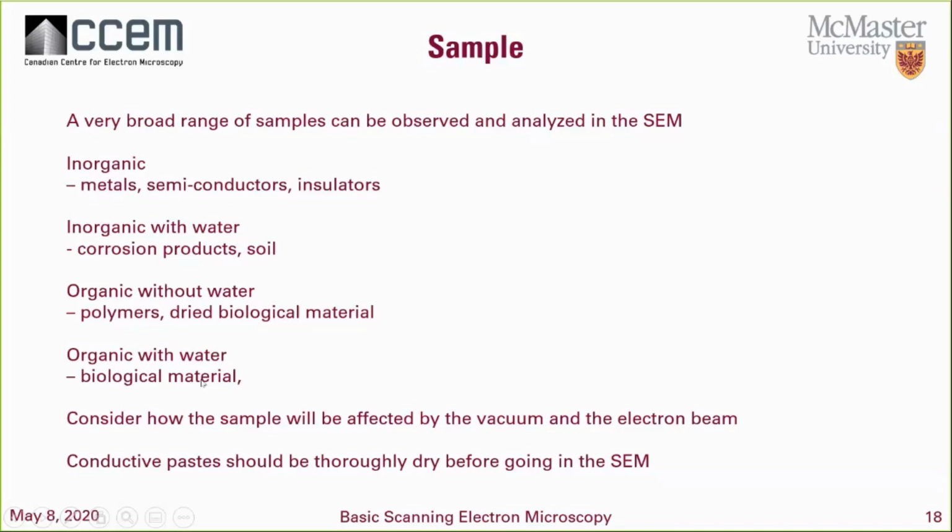One of the things we quite often use in the microscope are conductive pastes to improve the conductivity of materials, joining the material to a substrate or the holder such that we get a path to ground.